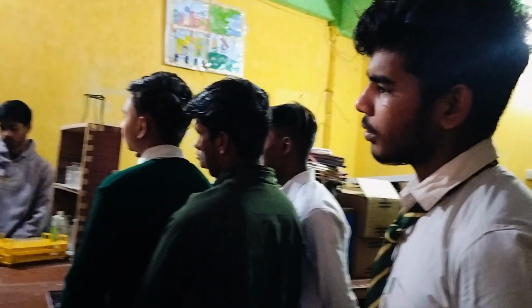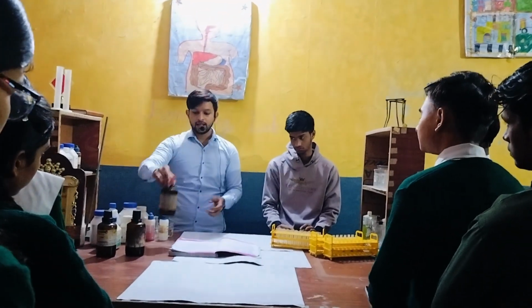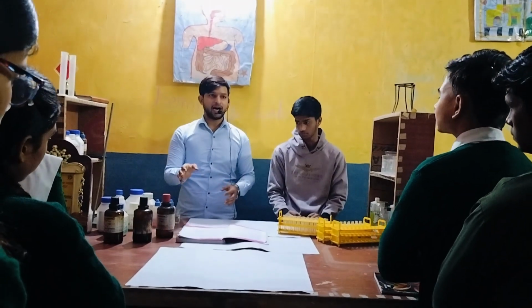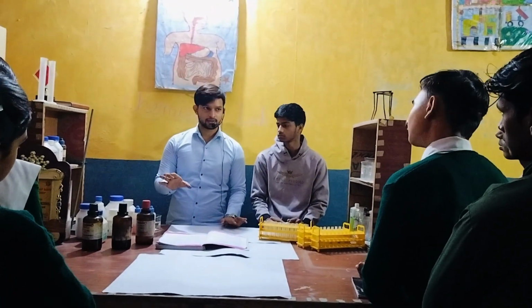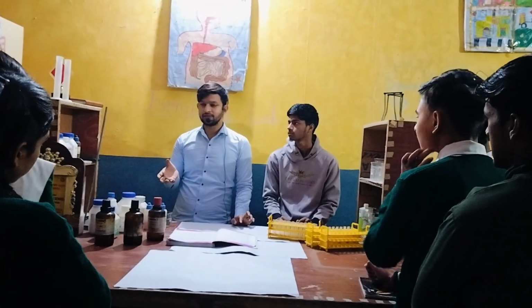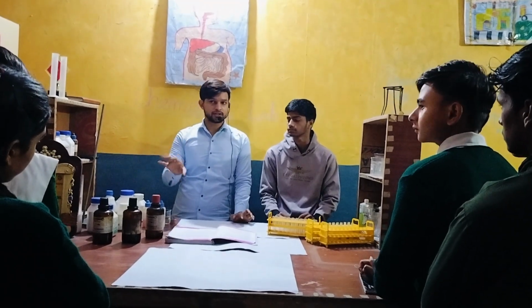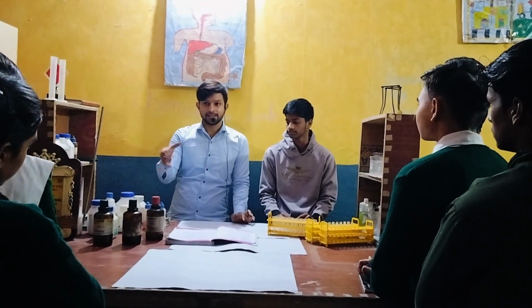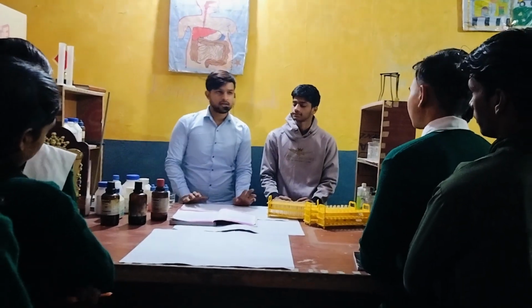And in this bottle we have hydrochloric acid, that is HCl. These three acids are in the concentrated form, which means they are pure. If we want to make them diluted, what do we have to add? Water. We will add water and these acids will then convert into diluted acids.